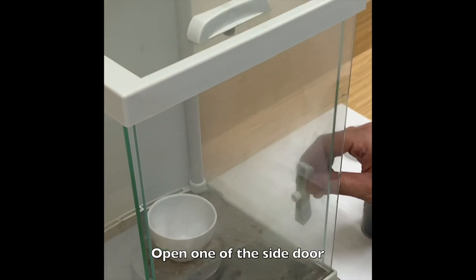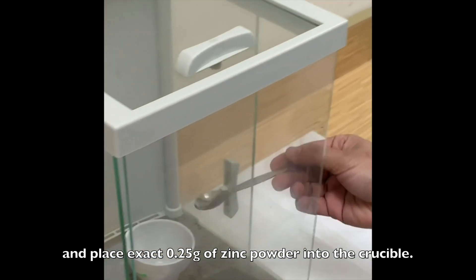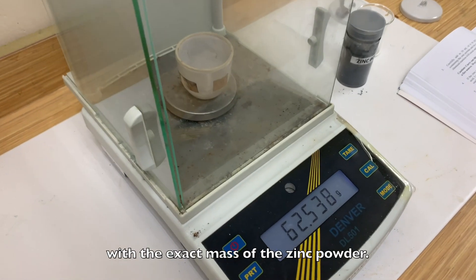Open one of the side doors and place exactly 0.25g of zinc powder into the crucible. The crucible was weighed again to record the exact mass of the zinc powder.